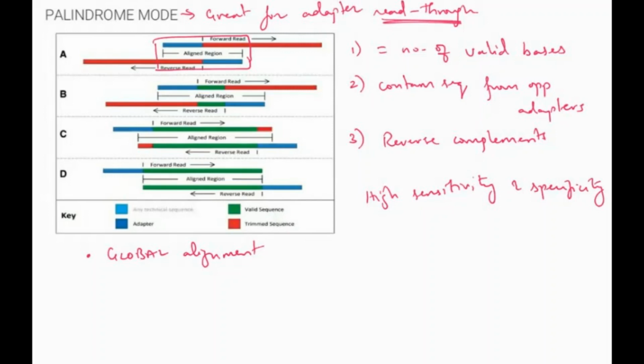If not, then the adapter proceeds to align or position the reads backwards. Even if there's only a small fragment of the adapter overlapping, the overall alignment is more than enough to detect adapter sequences. The process completes when the overlapping region no longer reaches into the adapters.